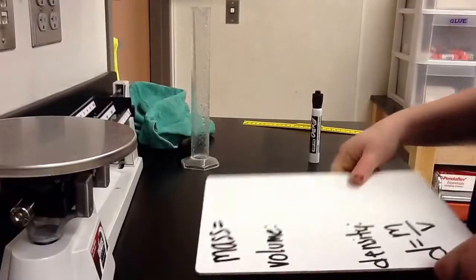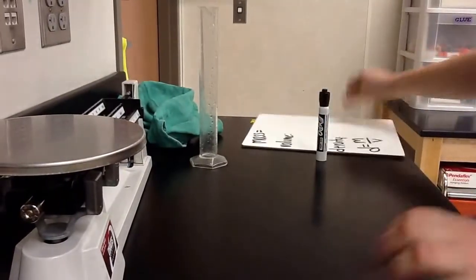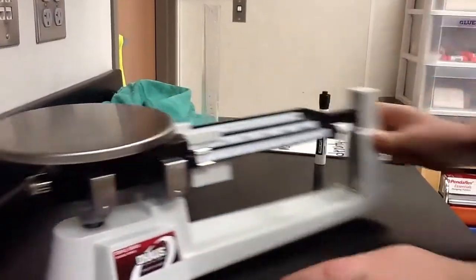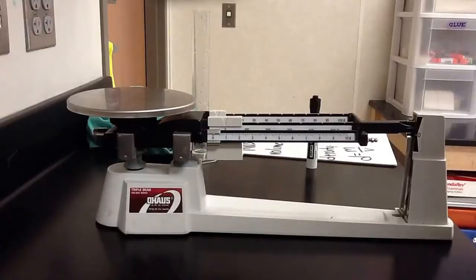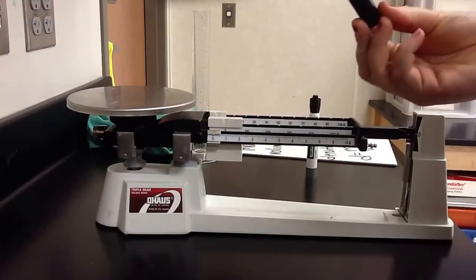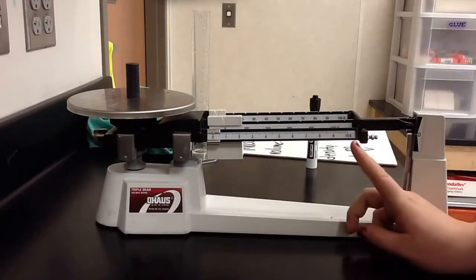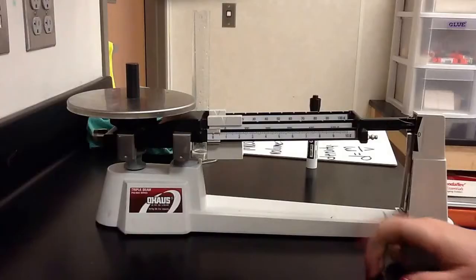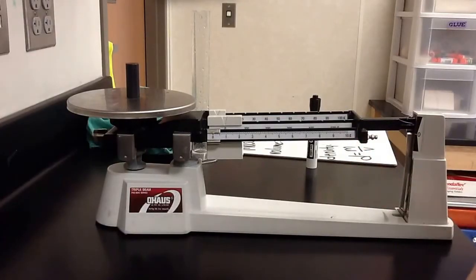Okay? So, the first thing we need to do is find our mass, and we do that with our balance. This is a triple beam balance. You just put your object on the pan. Remember that mass is measured in grams. If you ever forget which tool to use to measure mass, look for the one that has a G on it, because G stands for grams.